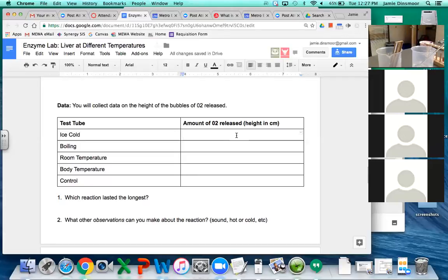This one, we're going to let it boil. So you can just take the thermometer out, and then once it starts boiling, we'll measure the temperature. So this one is good to go. We only need to heat it a little bit. Yeah, this is working amazing.